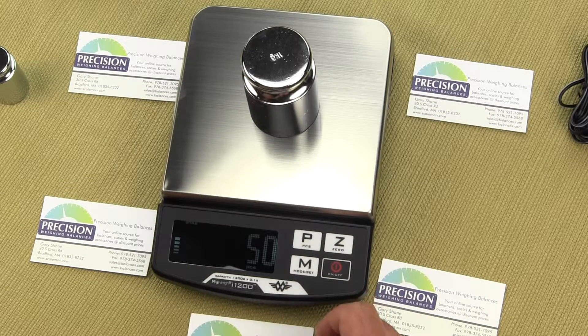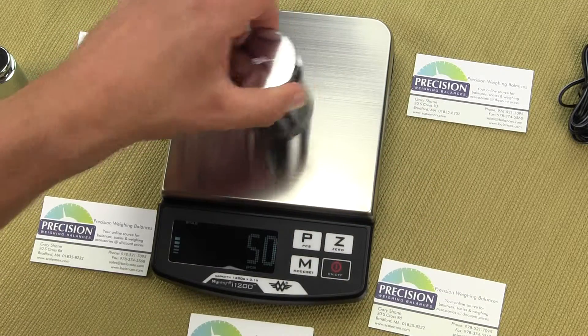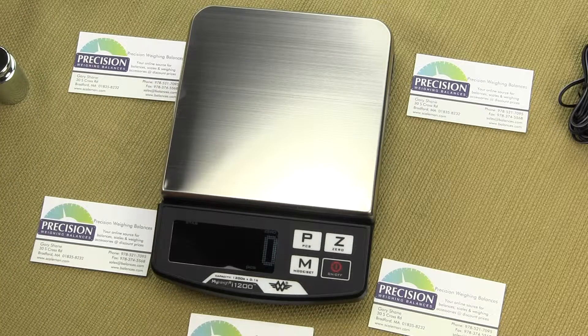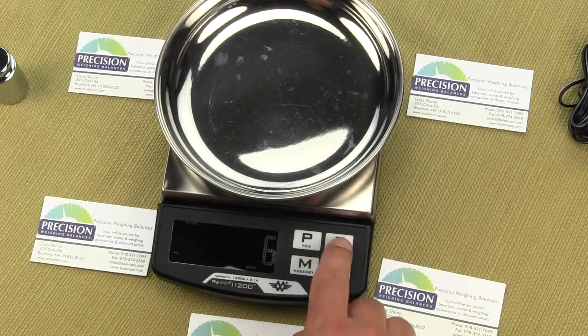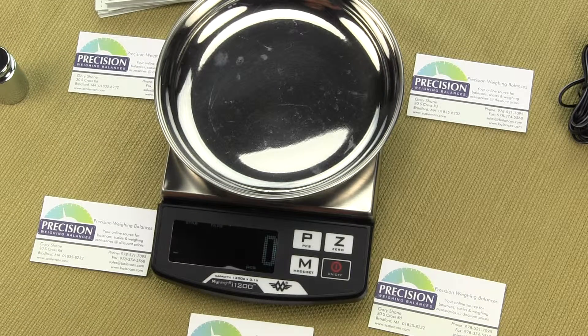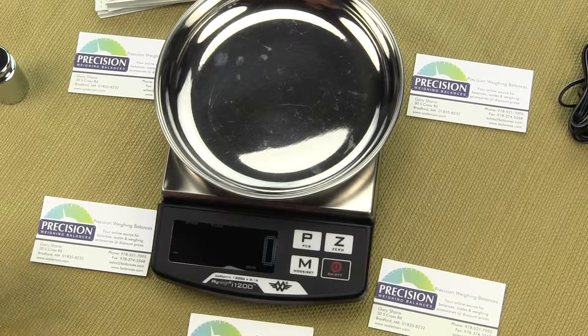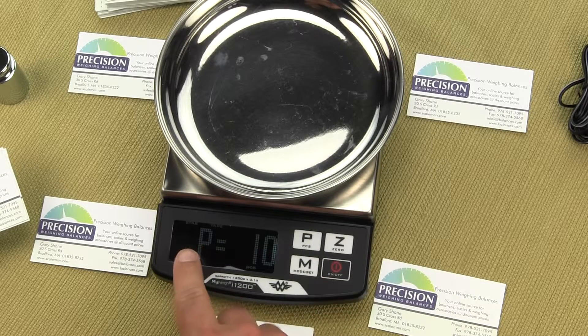The scale also has the ability to do parts counting. Once in parts counting mode (PCS), we can tare out a container. We'll put the weigh dish on the platform and hit the Z key. We'll count business cards with a sample size of 10. Press the P key and you'll see P is equal to 10.